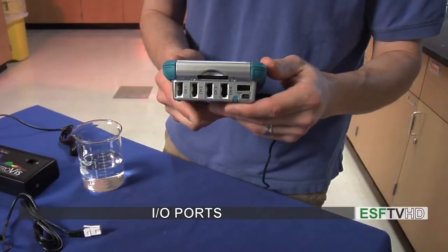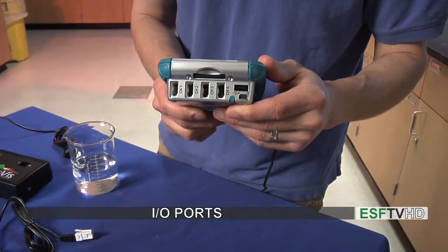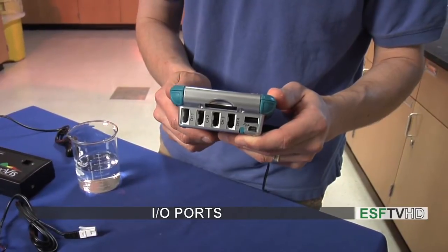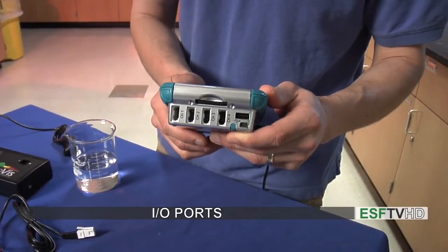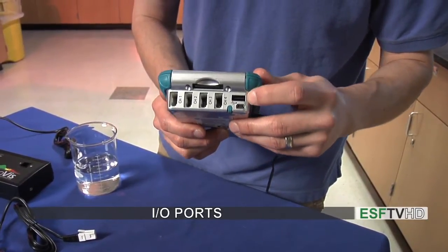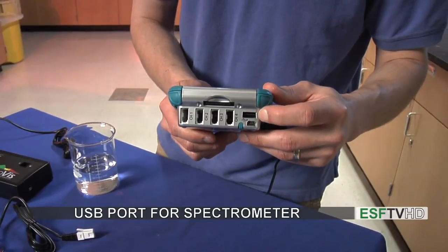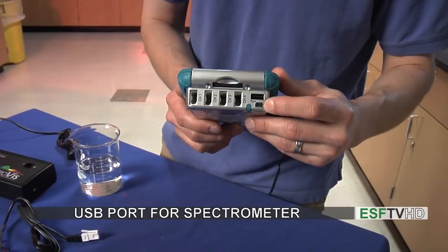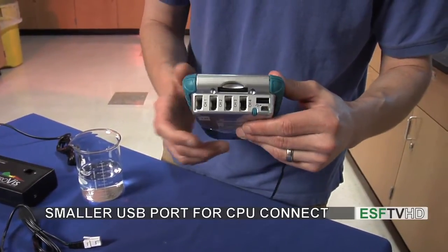On the back of the unit we have the different ports where we can plug in our probes. There are channels one through four and it doesn't matter what channel you use — the probes get plugged into those different channels. We have a large USB port which is used for connecting the spectrometer, and a small USB port which is used for connecting the unit to a computer so we can export data.